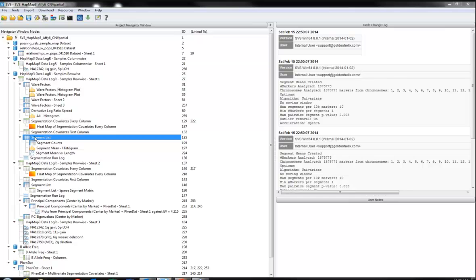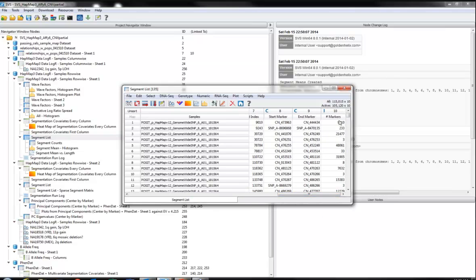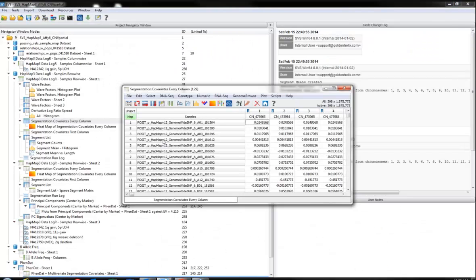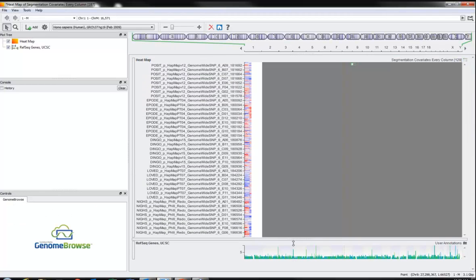Here, well, I think this has been sorted differently. Oh, there we are at the top, 0.0249. So it's exactly that same one. What we would have is the first 9,000 columns in that spreadsheet replaced with that value, and so on through all the other samples. And by having this kind of spreadsheet, we can start doing other things. For example, we can put it into a heat map, and this will take a few minutes to draw.